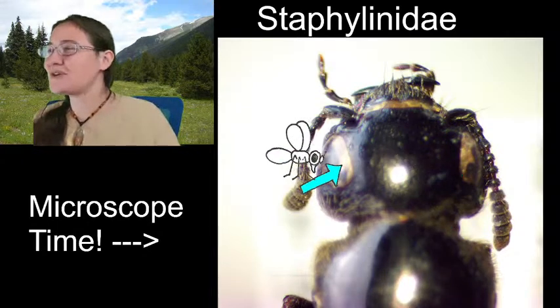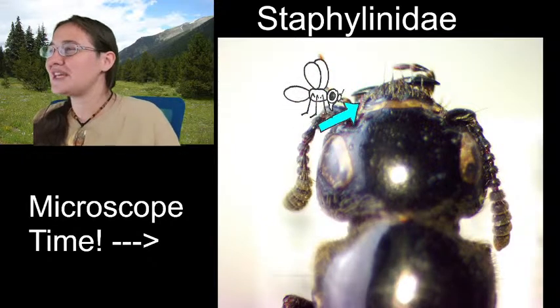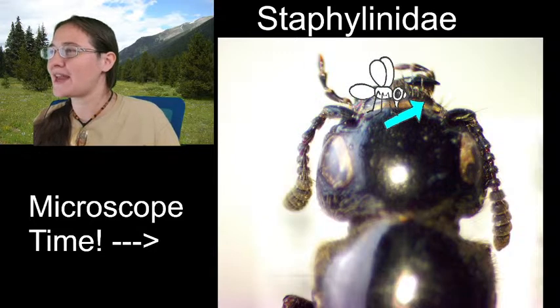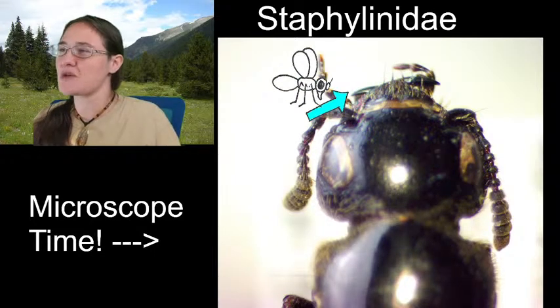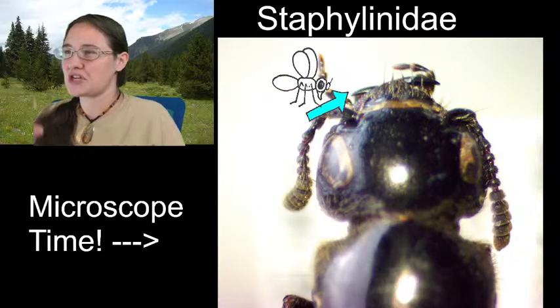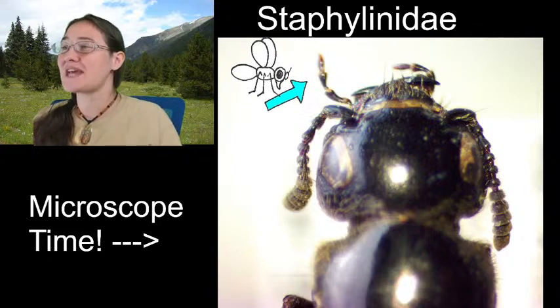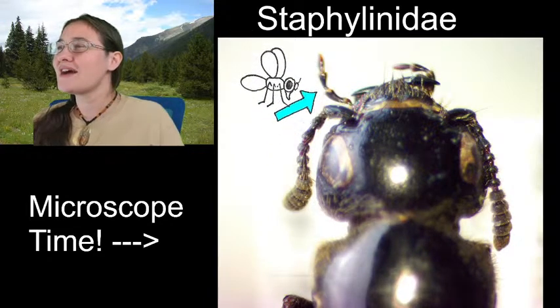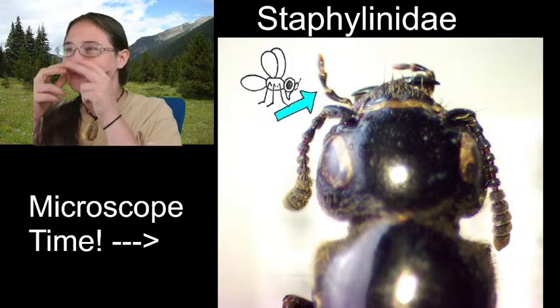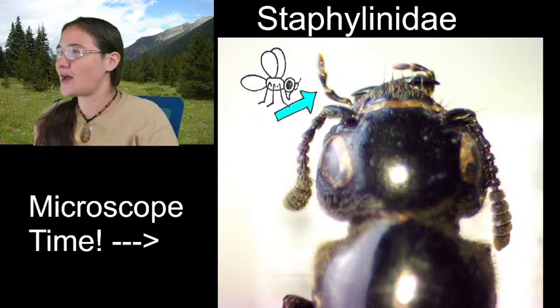You've got the two compound eyes here and here, and then this part here that comes around and is sharp on that end, and this piece here that comes around sharp on that end, those are the mandibles. That's where my rove beetle is going to be chewing on its prey, and it's probably going to be attacking other insects. These are mouth fingers. These are those labial palps. They help push food towards the mandibles and make sure that my beetle has the ability to swallow all that food.